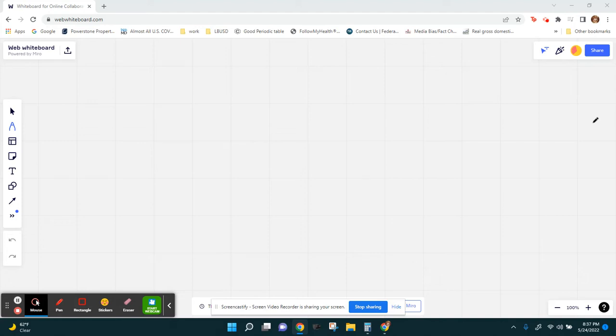Okay, so this video is going to show us what we do with our data and how we go ahead and calculate the concentration of an unknown solution using the Beer's law equation. So we're using Beer's law. This is not beer as in the drink, but the name of a scientist. I can't remember his first name, Beer's law.